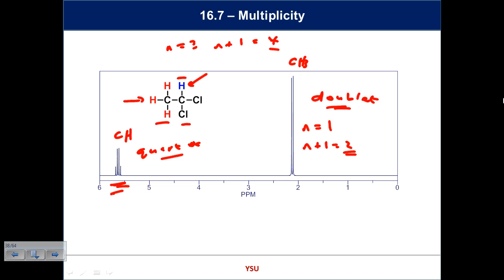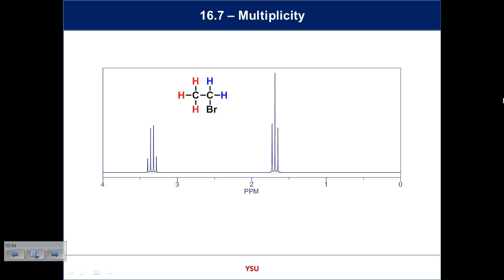So, here we go. This molecule, slightly different. I changed it into CH3, CH2, Br. Chemical shifts are up to you. You have red protons, which are simple alkyl, then you have Br neighbor further downfield. That's why they show down there. In terms of the shape, this signal is for the CH2 group. And it is not because it is a CH2 group that it has 4 lines in the signal. It's got nothing to do with that. It is to do with how many neighbors you have.